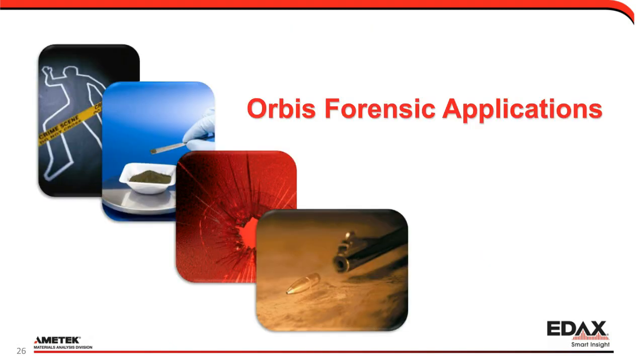Now I'm going to be discussing some applications of the Orbis system to measure forensic samples which you may encounter in your laboratory duties.